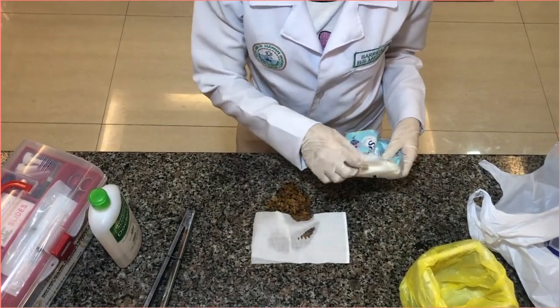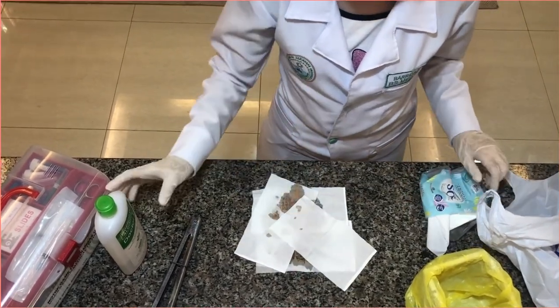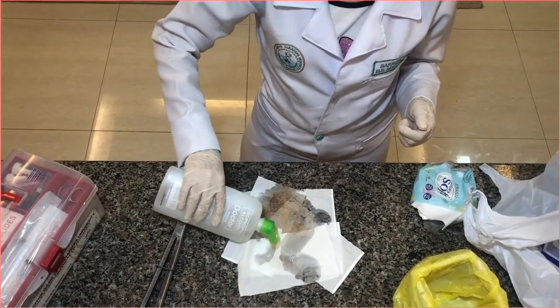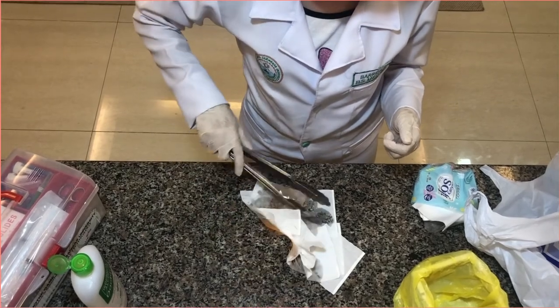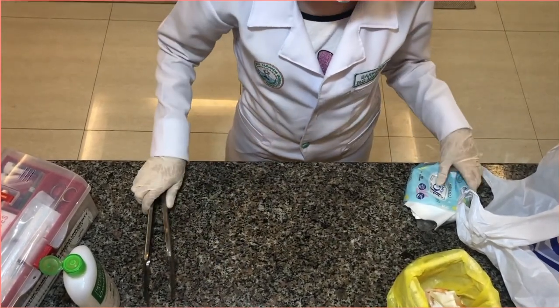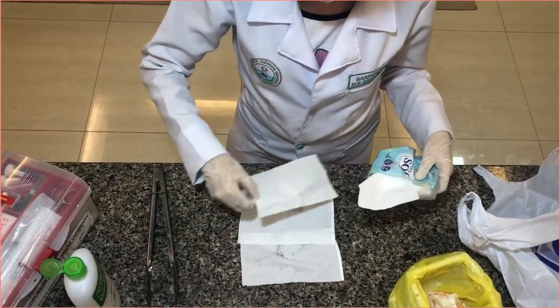Place absorbent material on the spill and cover the whole area. Pour appropriate disinfectant concentrically, starting from the outer part to the center. Observe appropriate contact time. Pick up the absorbent material using tongs and place inside a biohazard bag. If there are sharps, pick up using tongs and place in a sharps container. Perform another round of cleaning until the whole area has been cleaned and dried.